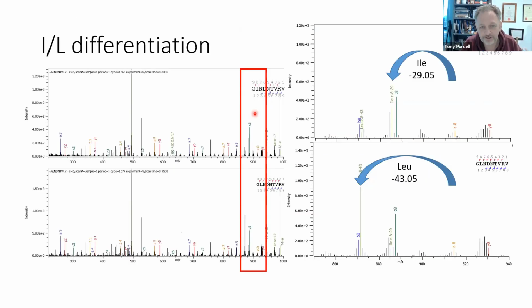And the short answer is that even after just a few weeks, we've been able to start to see disambiguation. Here's an example where both flavors of the peptide are present within a mixture. They are chromatographically separable, obviously.